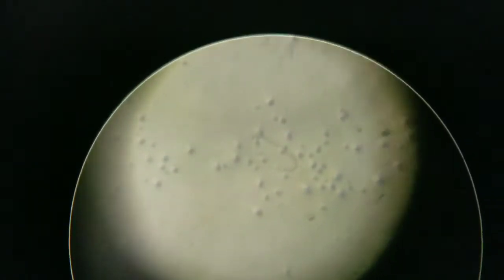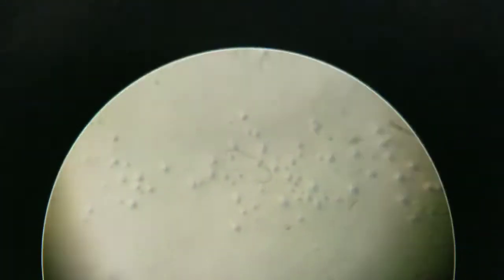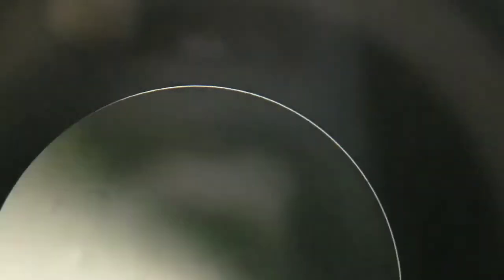Or the species that I believe they are, Y. enterocolitica, is non-motile at temperatures below 72 degrees Fahrenheit, and it's like 67 in this room, so they wouldn't be moving around anyway. So yeah, I finally succeeded in imaging bacteria with my microscope.